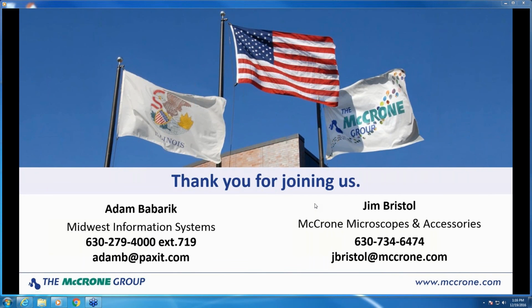PAXit Extended Security can be utilized with any optical system that can accept the PAXit compliant camera itself, CCD, or generate images or movies that can be uploaded into PAXit Extended Security. Remember, PAXit Extended Security is not limited to just images or movies. It can also accept reports, printouts, and other documents with the same level of security.